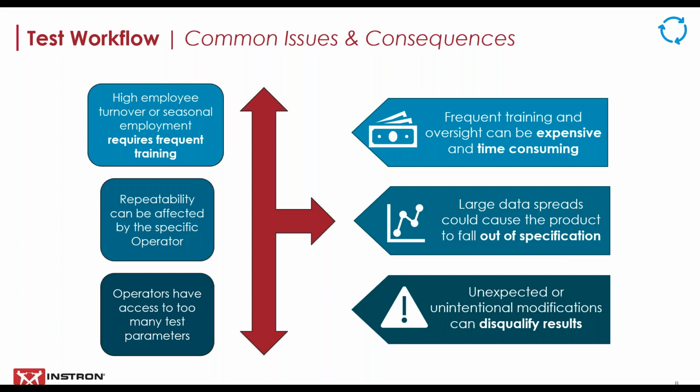Next, we will look at test workflow, which we can generally define as how an operator runs a test. The individual steps are often captured in an SOP, but a combination of training and experience are often needed to avoid missing or incorrectly performing a step. Industries with high employee turnover or seasonal employment tend to need frequent training for their new operators to ensure testing is being performed properly.